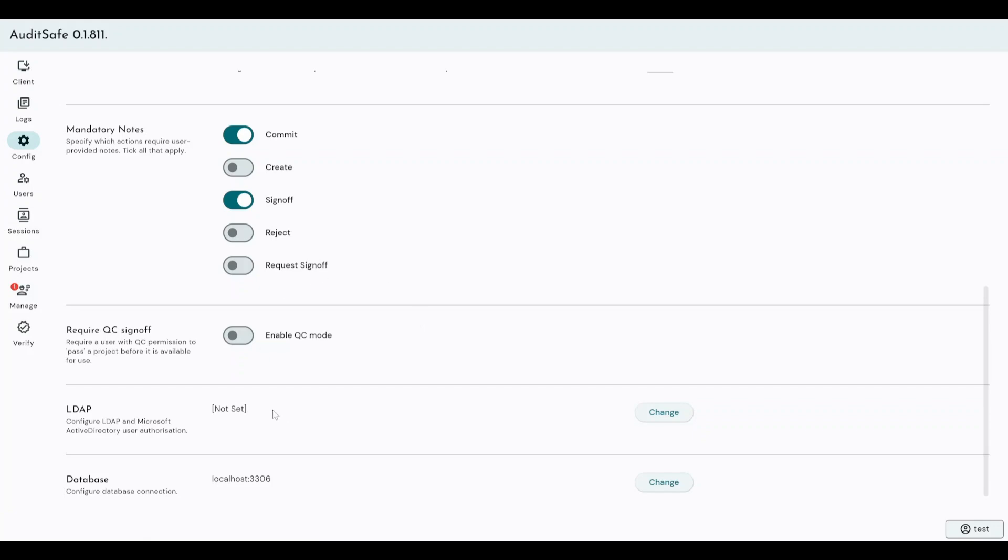The LDAP configuration is where you would set your Windows Active Directory configuration. Now I'm not part of an Active Directory on this computer for this demonstration, so I'm not going to be able to set that. But we do support Windows Active Directory user authorization, and this is where you would set that.